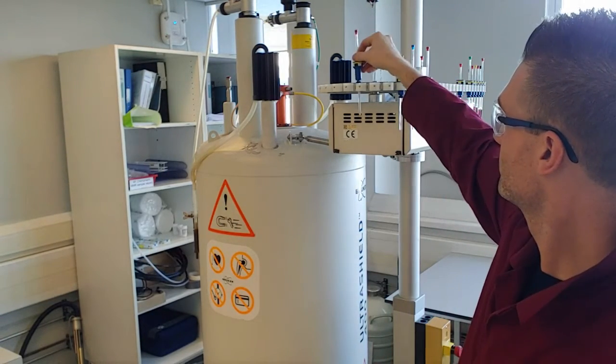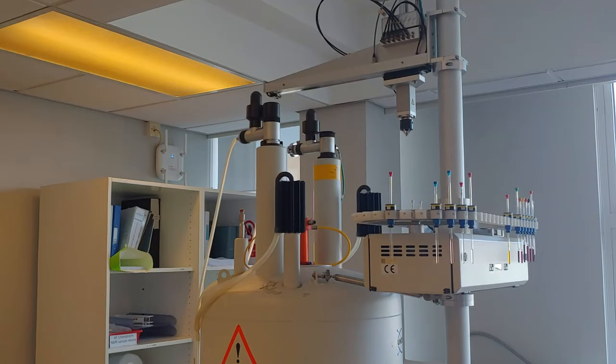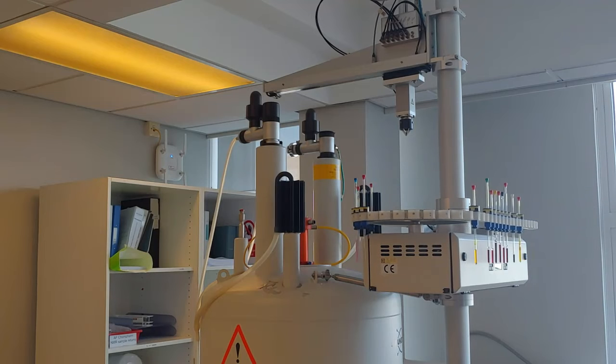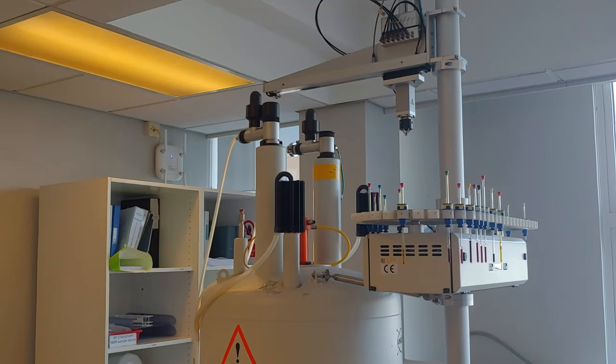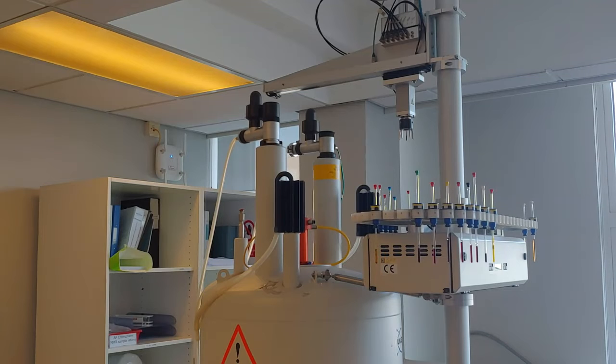We then place it onto the auto sampler and then we go to the computer to run our spectrum. So the auto sampler will move to our sample, just sped this part of the video up because otherwise it takes a long time, and once it reaches our sample the robot arm at the top will come down and pick it up.